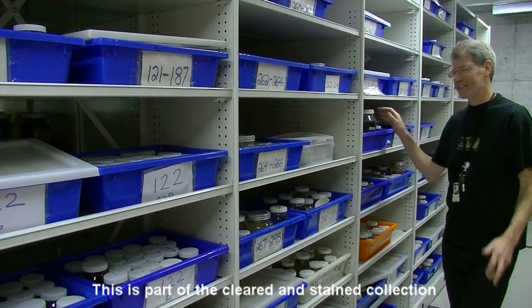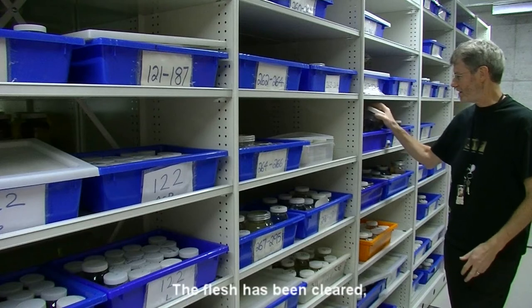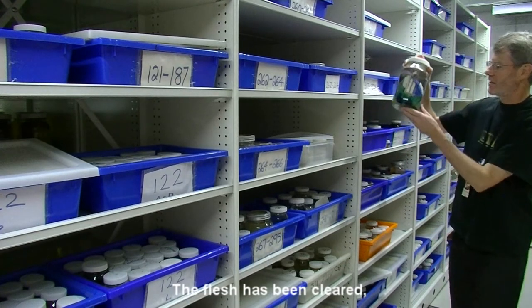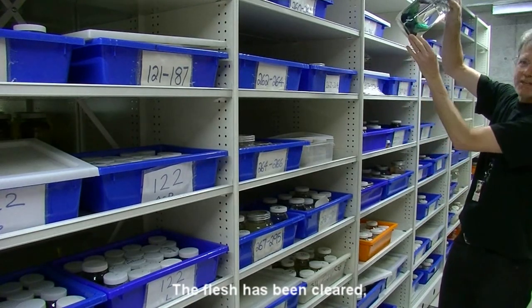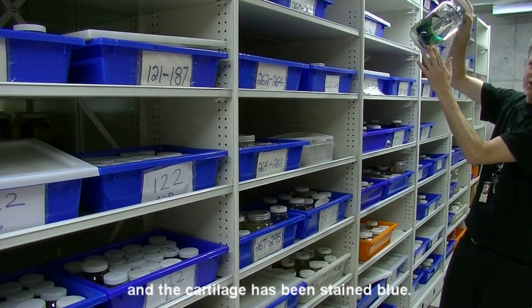This is part of the Cleared and Stained collection. We have hundreds and hundreds of specimens that have been cleared and stained. If you look at this, you can see that this fish — the flesh has been cleared, the bones have been stained red, and the cartilage has been stained blue.